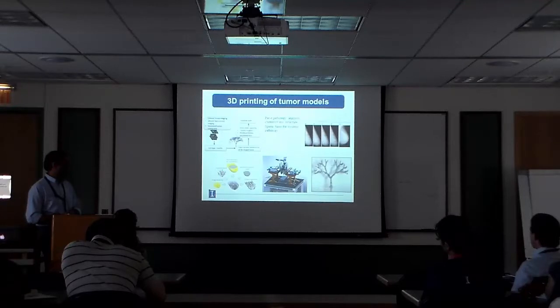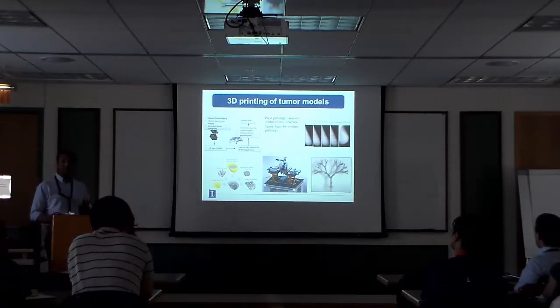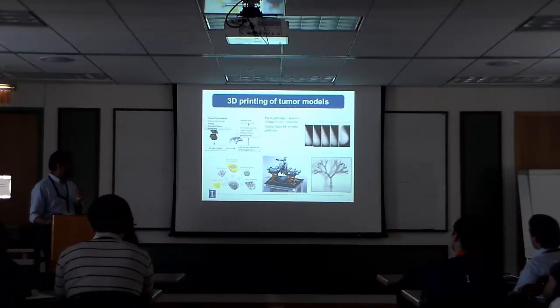In this particular case, this is just a toy example. What we're showing here is this bar is 1 millimeter. We can actually print trees that go down from millimeter-sized trunks to, I don't know if you can see it very fine here, about 50 micron features quite easily. 50 micron means we've got about 15 micron of control on how we go about doing this. If you look at commercial 3D printers, they have about 1 millimeter of control or so.